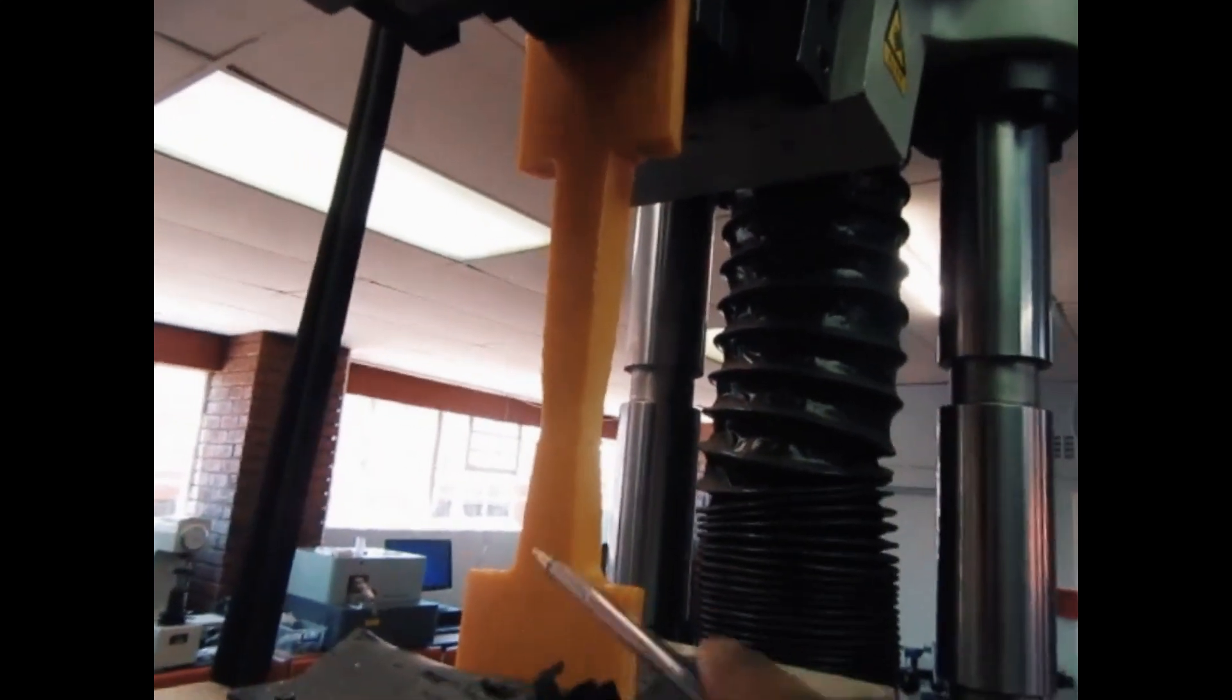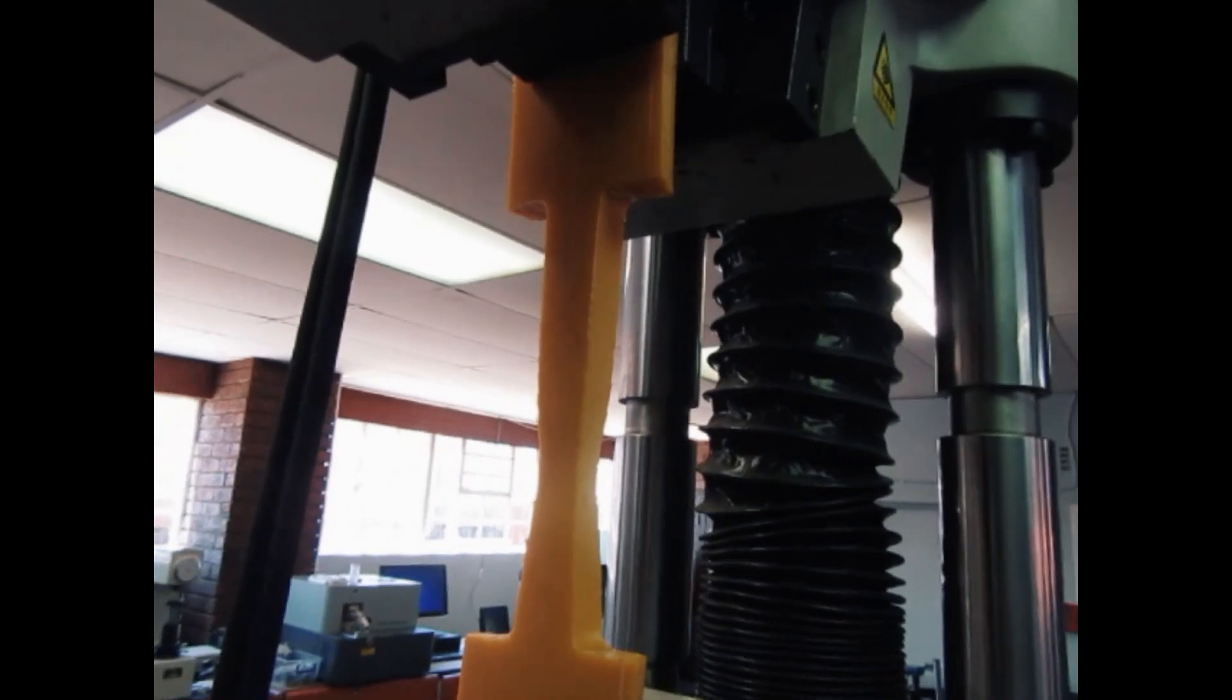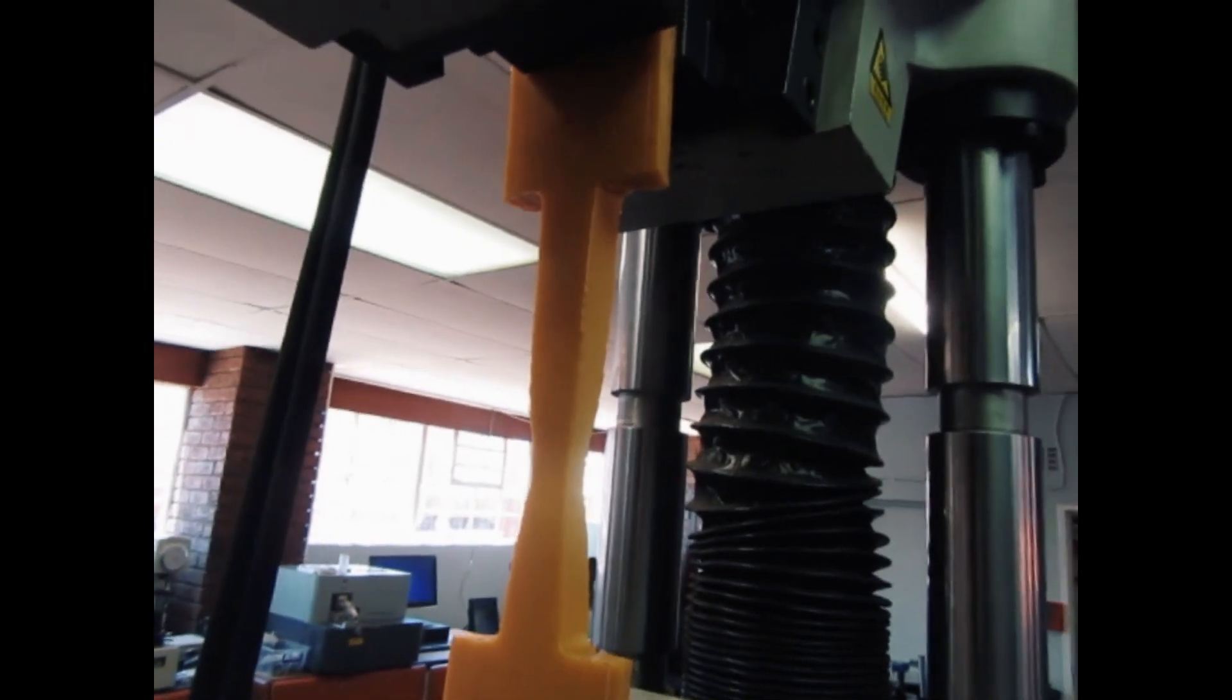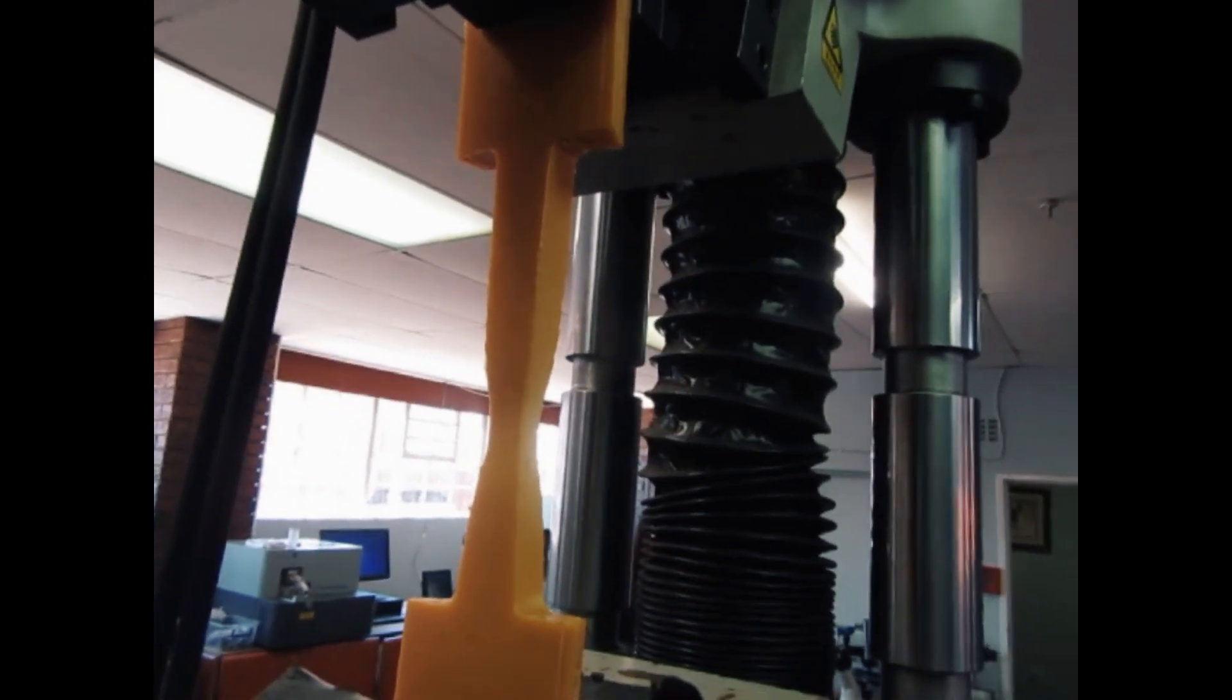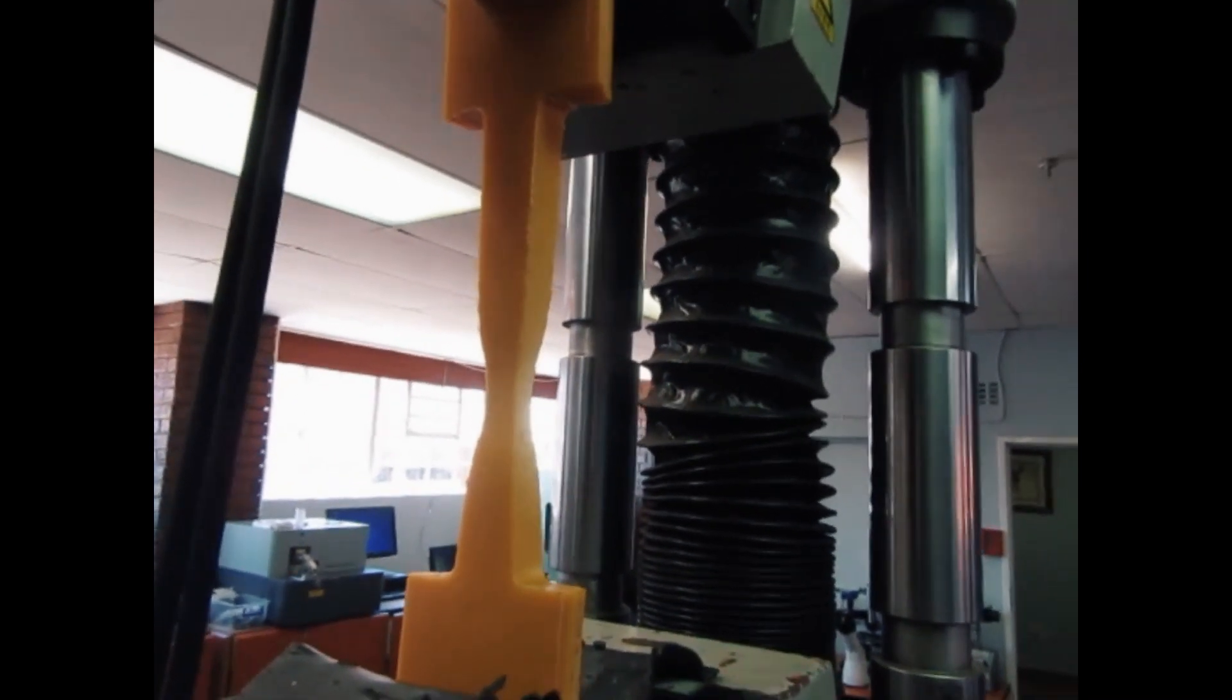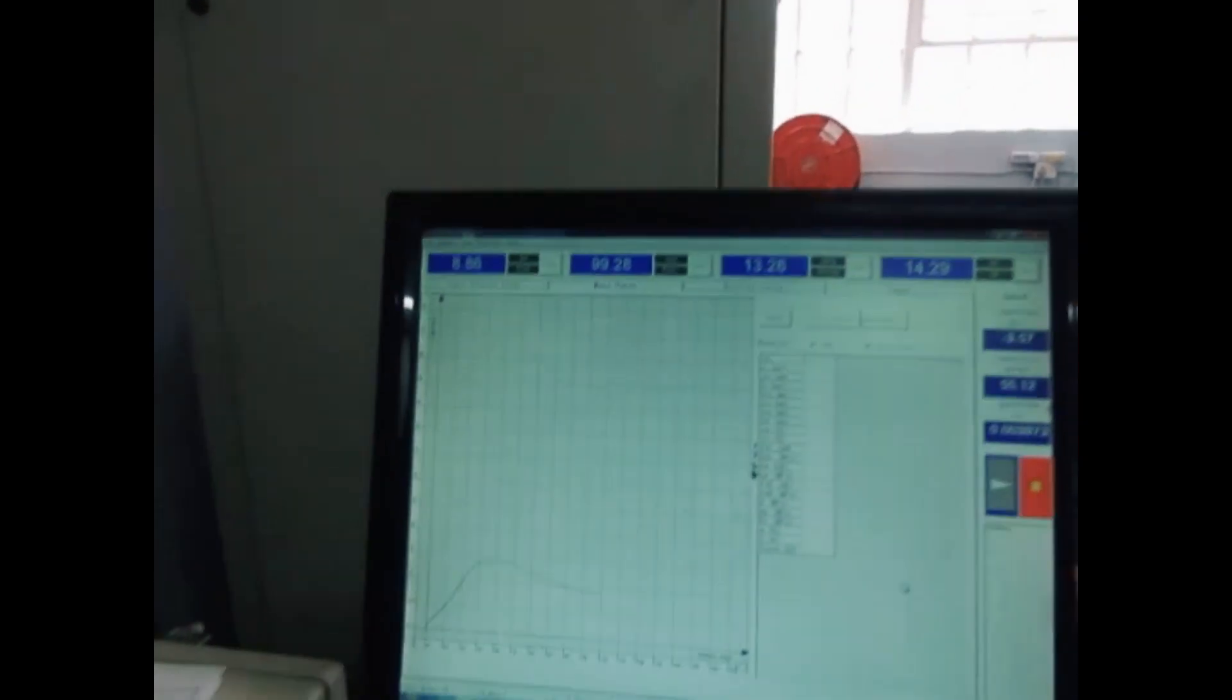And we need this, but we can just, for experiment's sake, just look at it and see how it goes for people who don't know how the plastic tensile behaves when it's under the tensile test.